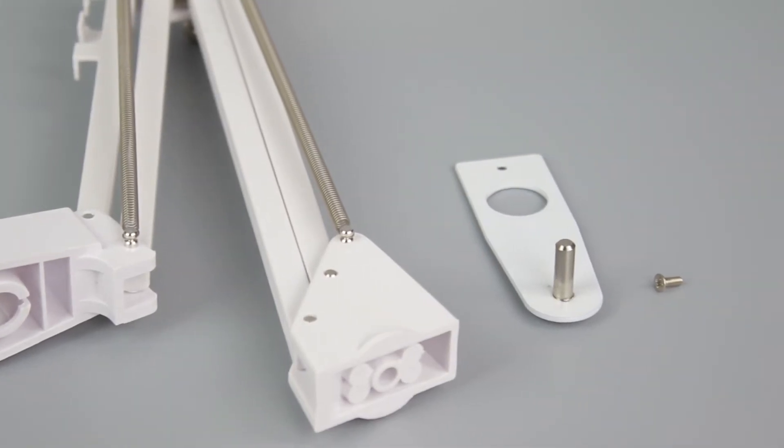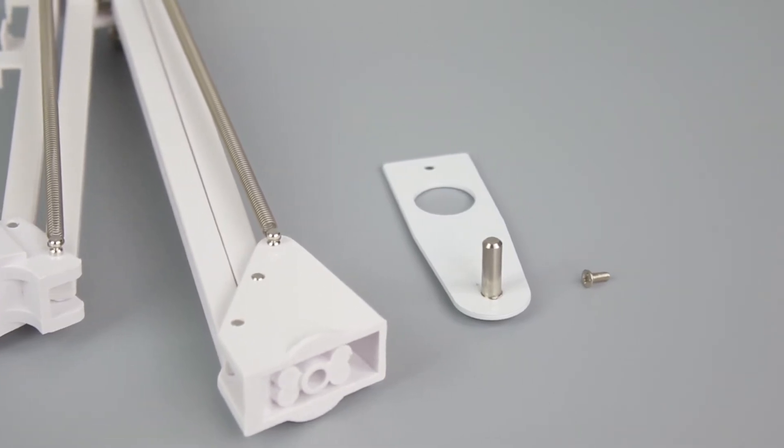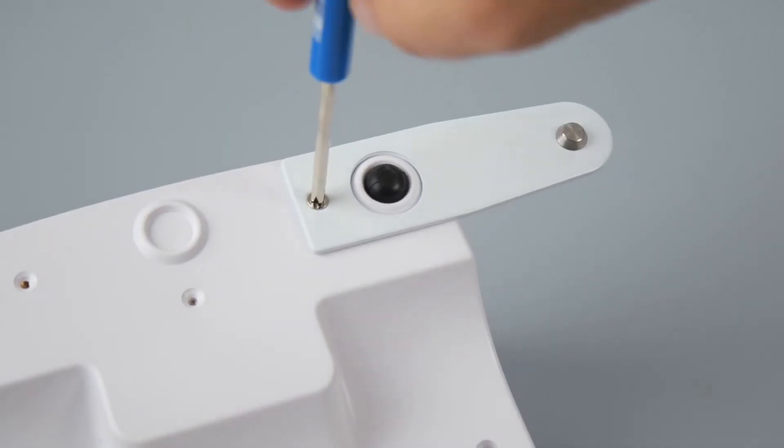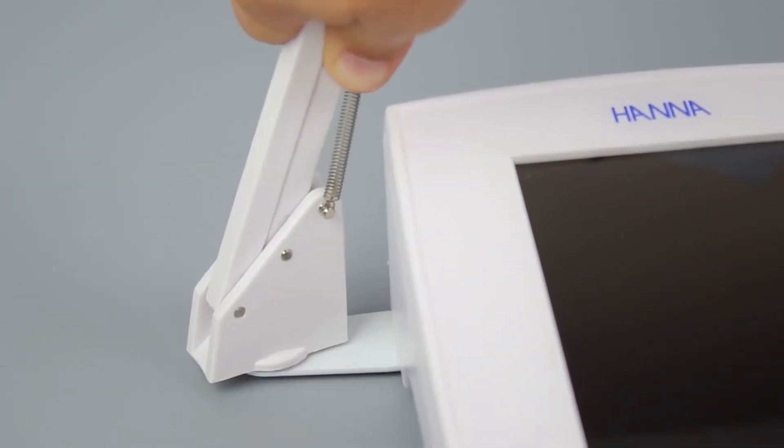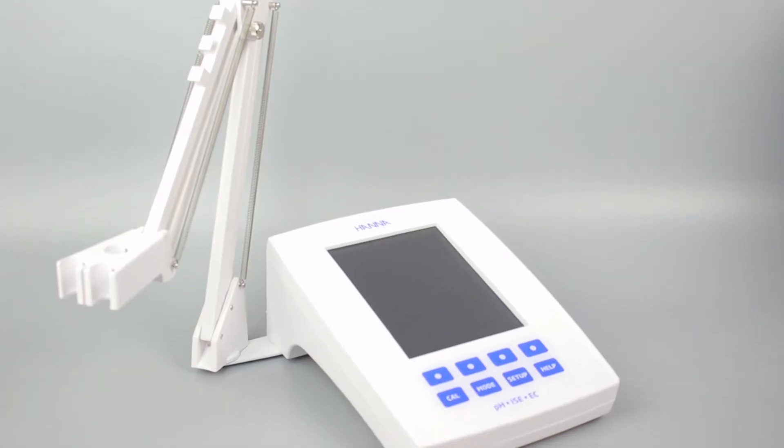Inside the box, you'll find the base plate, screws, and the electrode holder. To attach the holder, screw the base plate into the bottom of the meter and slide the arm into place. Once that is assembled, you can begin setting up your meter.